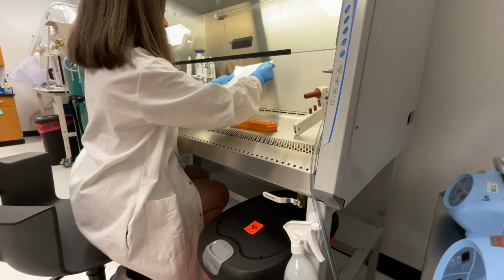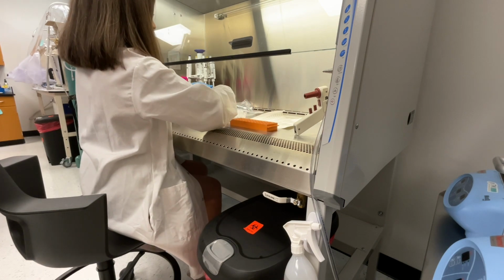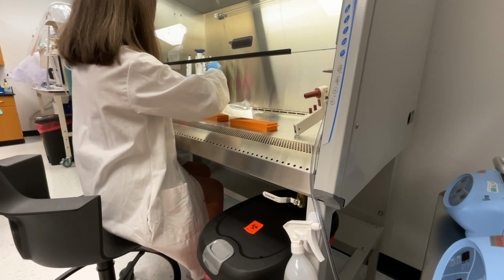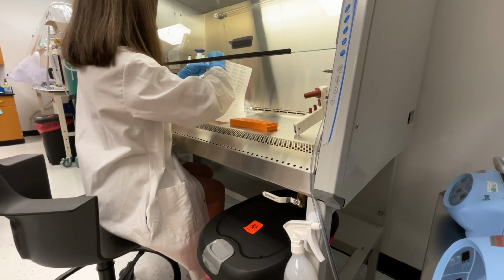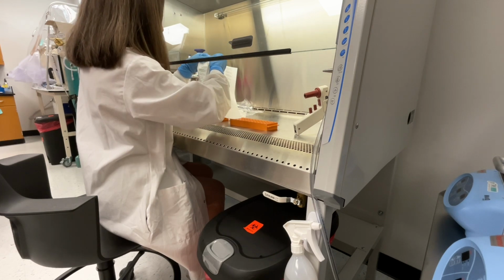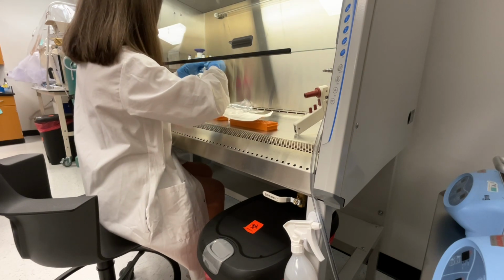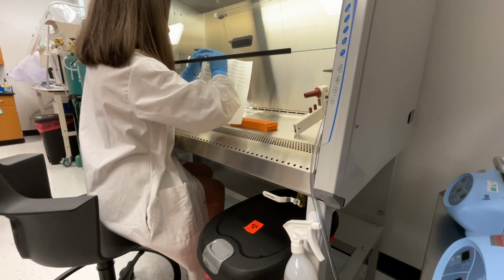Here I'm showing you some of the things that I did today. So we had new bacterial strains that we needed to freeze down, and we basically freeze them down in a very small tube so that we can have several different samples of them. And usually, you have to label all of your tubes. So instead of labeling them all by hand, I like to print out on some sticker paper, and that way that makes it a lot easier for me. So I just end up getting these stickers and then sticking them onto the tube, and so that's what I'm doing here.